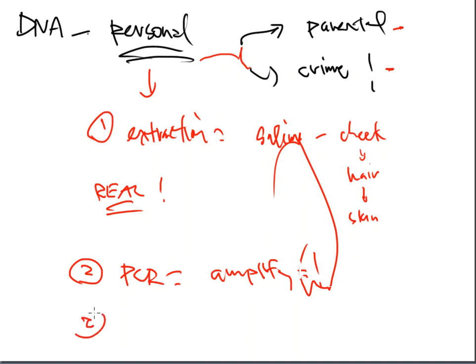And then finally, number 3, we're still undergoing the electrophoresis of the PCR amplification, extraction kind of process. And this is something that you have already done in the other 2 labs that we've already completed. There's going to be no difference really here.